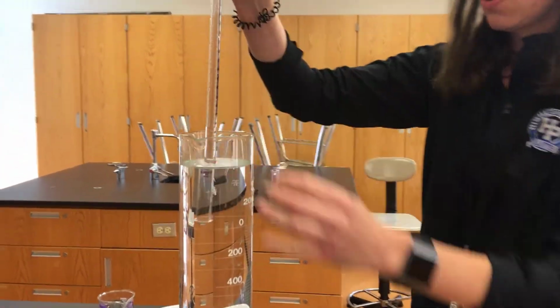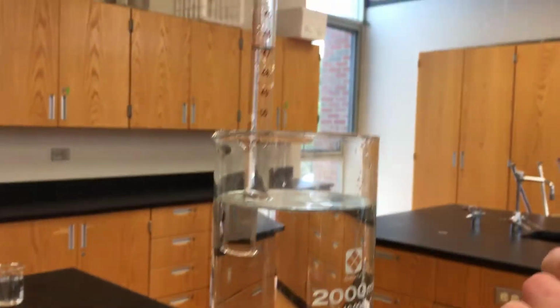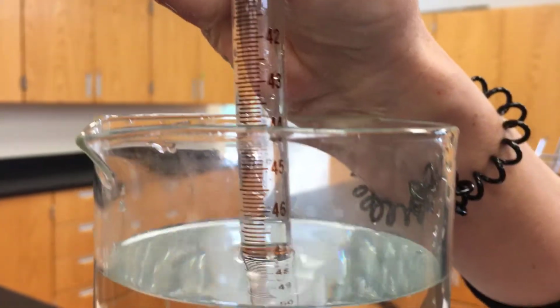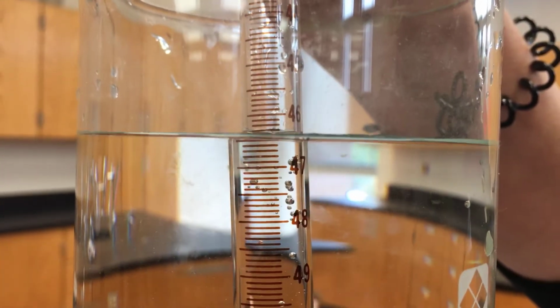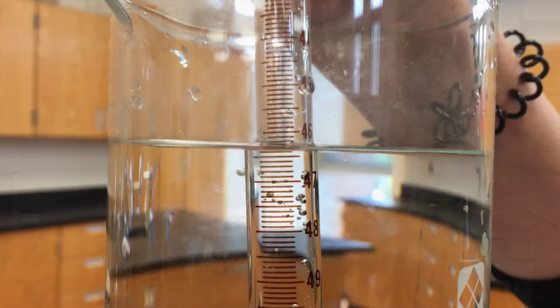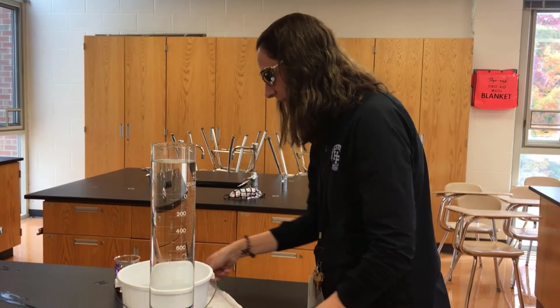Okay, so what we'll do is, if you notice, you can kind of see where the actual liquid line is for the eudiometer. We want to make that as close as possible to the liquid around it. Okay, so you guys will get to read this one. Okay, so now that you've been able to read that, we can let the butane gas go.